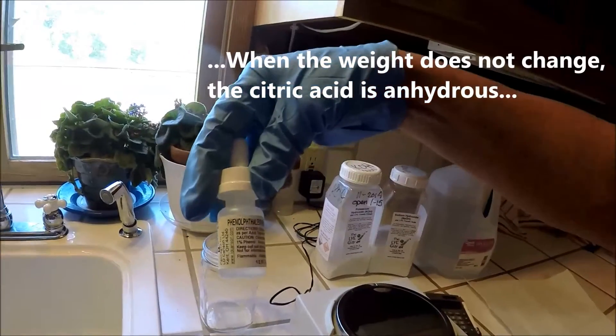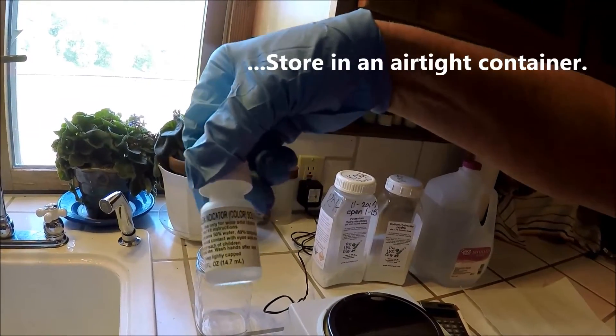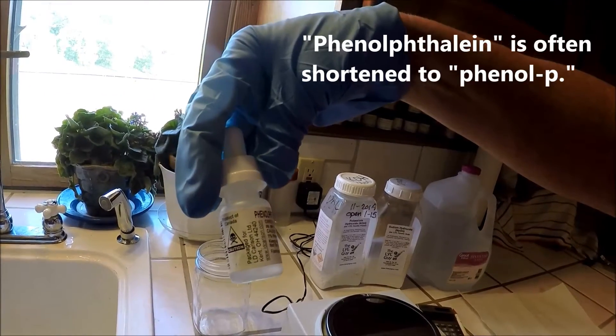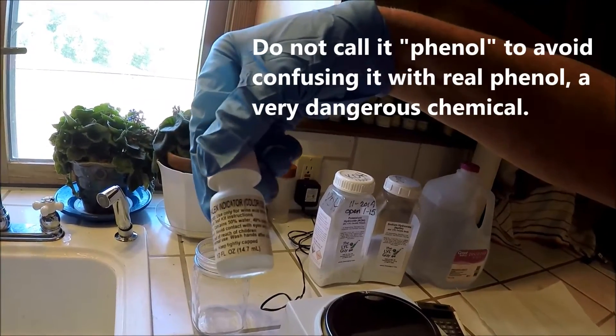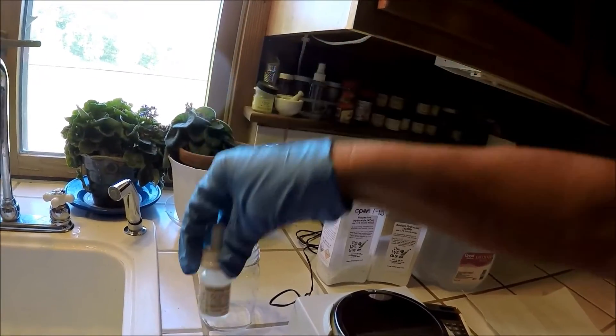In addition to that, you also need the infamous phenolphthalein indicator solution. You can buy this at various places, generally like a brewing supply would carry this kind of product. You can also buy it online.